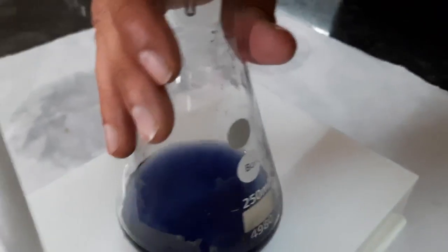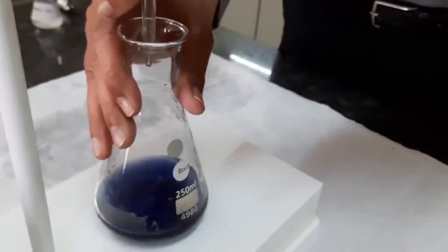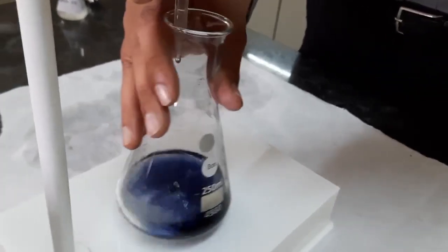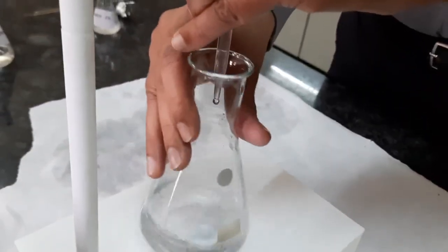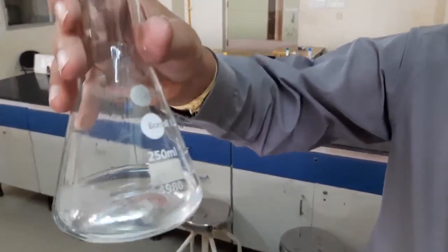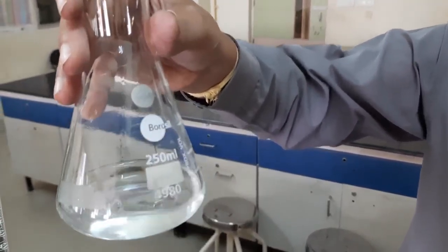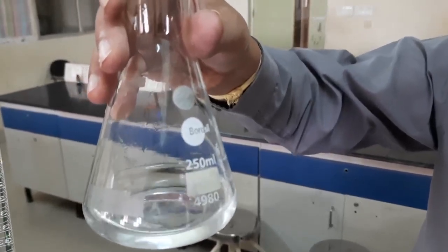Now the end point is blue to colorless. You have to do this carefully, because your readings will come in points. So 1 or 2 drops, a maximum of 3 to 4 drops, you will get the reading. See, you have got a clear solution. So you have carried out the titration till you get concordant readings, and this can be used to calculate the dissolved oxygen.